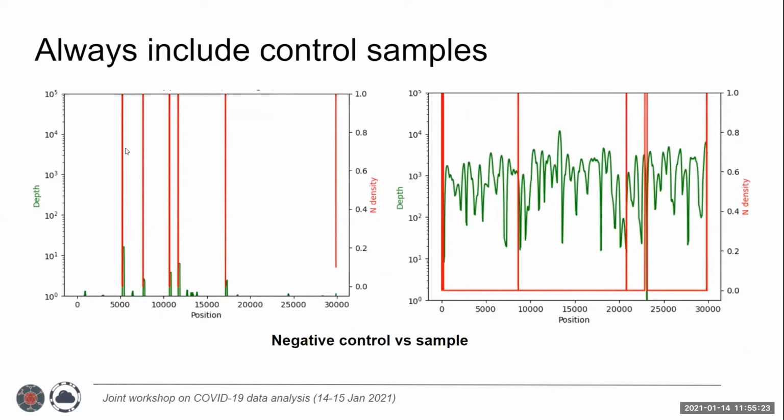Okay, so always using control samples. This is pretty obvious, but it seems to be overlooked sometimes. Controls matter, and every sequencing experiment should contain negative controls at a minimum. But not only that, they should also be bioinformatically analyzed to quantify the level of contamination introduced to the preparation and sequencing process. A human person should also manually check the contamination profile at this point before proceeding.